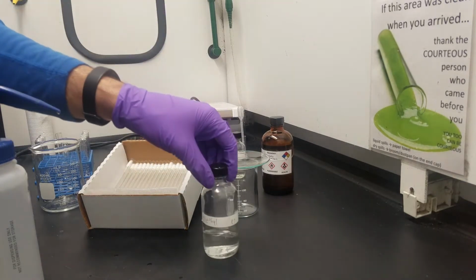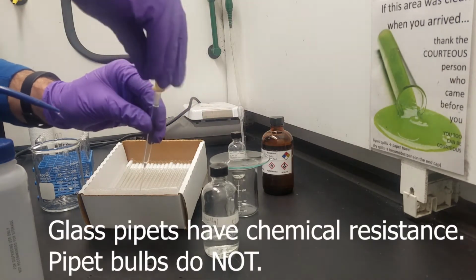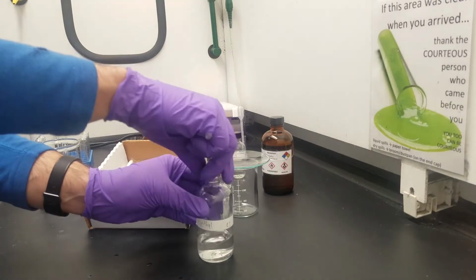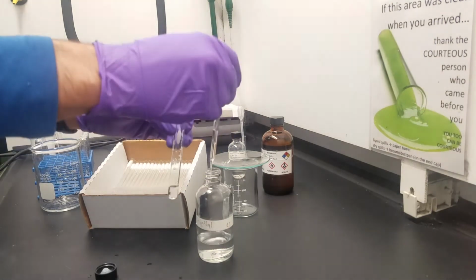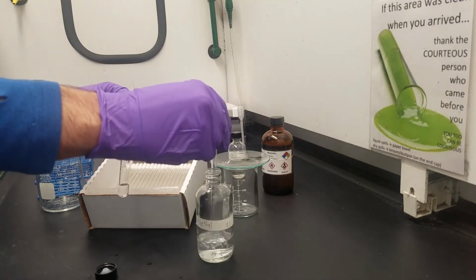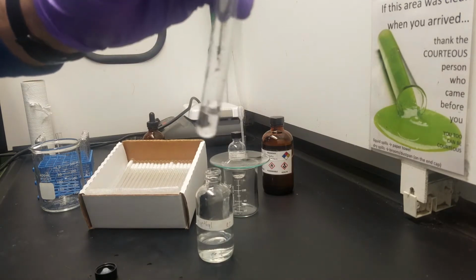Here what we're going to use is diethyl ether, which is exceptionally volatile and it can cause problems with our glass pipettes. So what we want to do is stick our pipette into our said liquid and suck it up and spit it out a couple times. If we don't do that, you'll see this subtle kind of spitting that it does, and it constantly drips out. Sometimes it's worse than others. But if you suck it up and spit it out a couple times, it builds up enough back pressure that it doesn't spit out anymore.